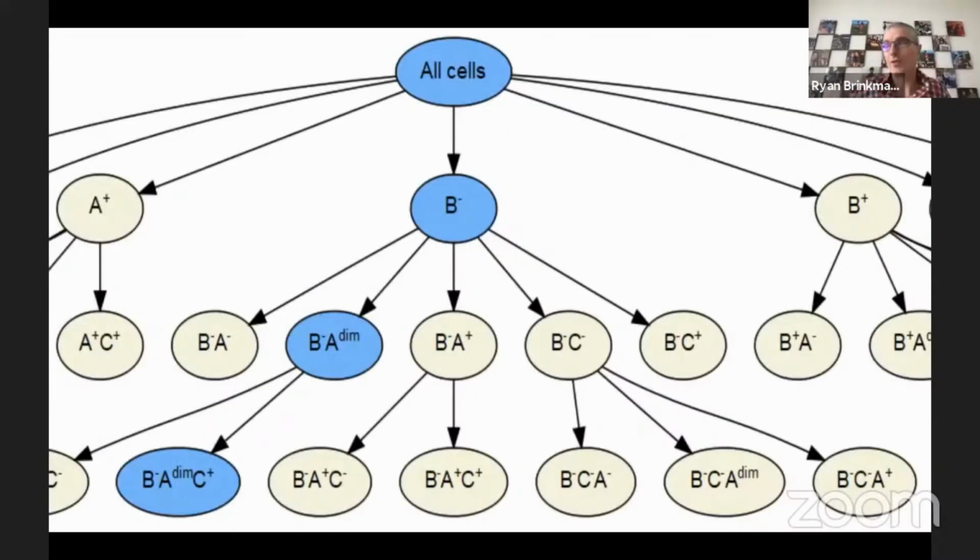But how to get around this problem of not knowing what to gate? So rather than just go through this one plot at a time, gating the 3 or 4 samples at the top level with the specific bivariate plot that you want to look at first, we have them look at all the possible combinations at the very top level. So if you have a 40 marker panel, we look at all combinations of those 2 at a time and say, hey, gate everything. Because unlike us, where we have limited time, we have an infinite number.